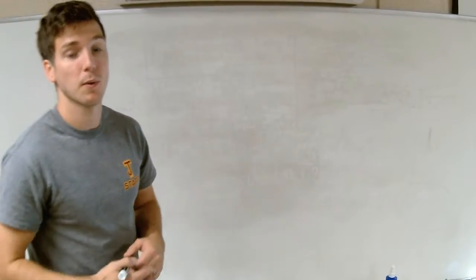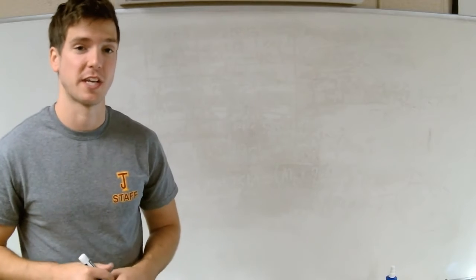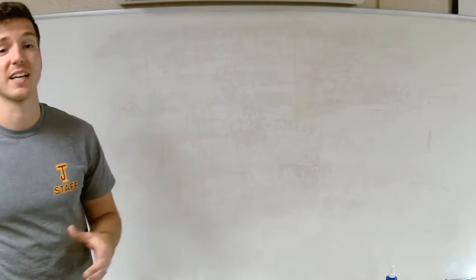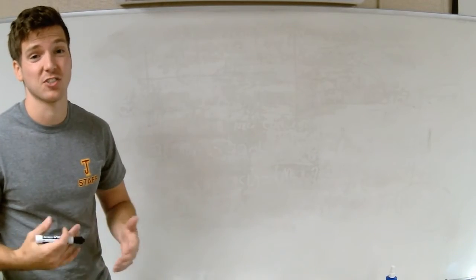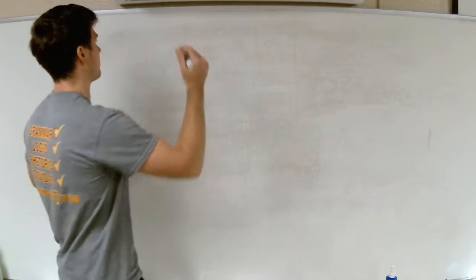Hey everybody, so to kind of coincide with molarity, I'm going to introduce us to titrations. We talked about it last year a little bit at the end of the year. Again, it's something that comes up early in AP chemistry. And titrations are actually pretty frequently used in chemistry. When you go to college, you'll be doing tons and tons of titrations.